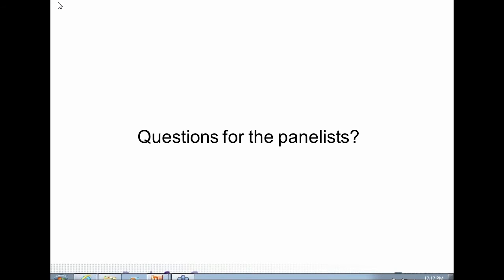I'm just curious, I'm going to keep asking, because I'm sure this colleague might want to know. Is there any experience when you do experience low purity? Is there anything you can do? Any repurification? Of the beads, or are we talking about individual patient? I think the person might want to know if there is an experience with low purity. It doesn't sound like you do have that, but if it did happen, is there anything you can do to rescue the sample?